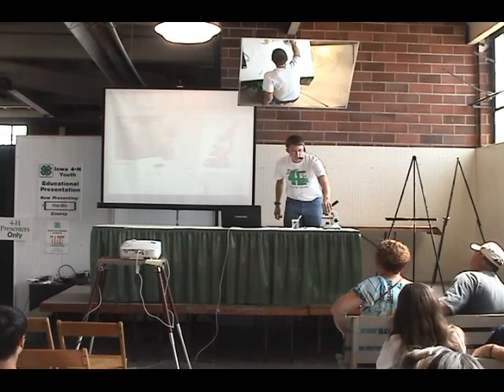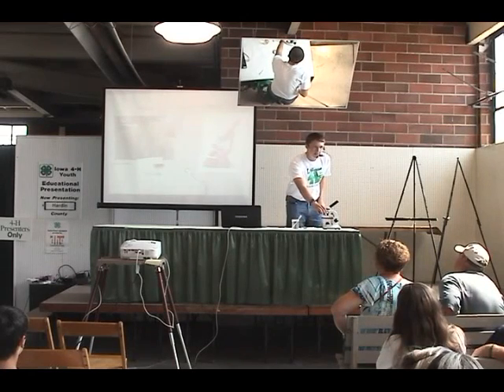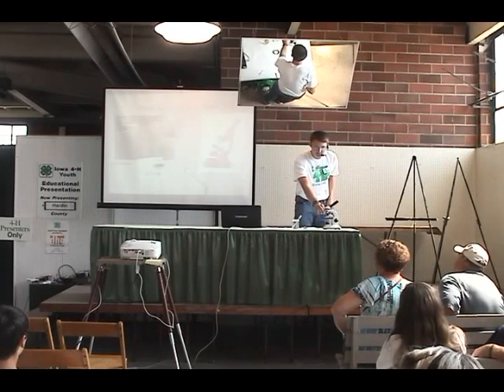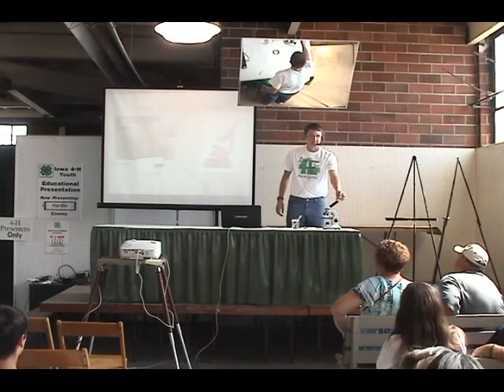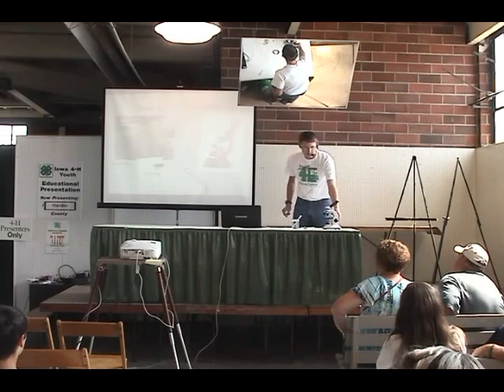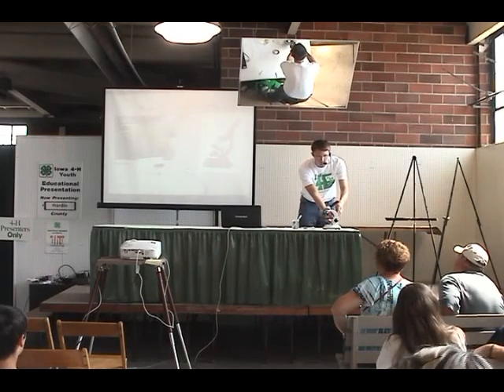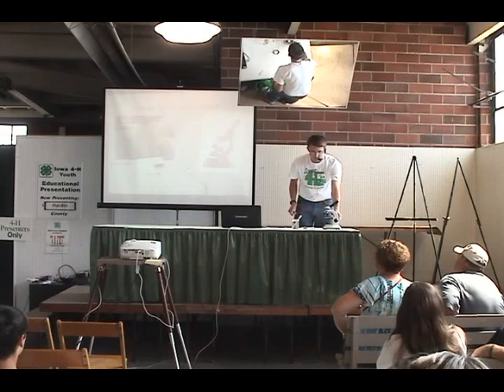And from there, you can swivel these things that look like a lazy Susan, and they're called objective lenses. They have different levels of magnification. This one, for example, is 4 times magnification, and the eyepiece is 10 times, so 4 times 10, 40 times magnification. And from there, you'll look into the microscope and adjust it into focus with these knobs.